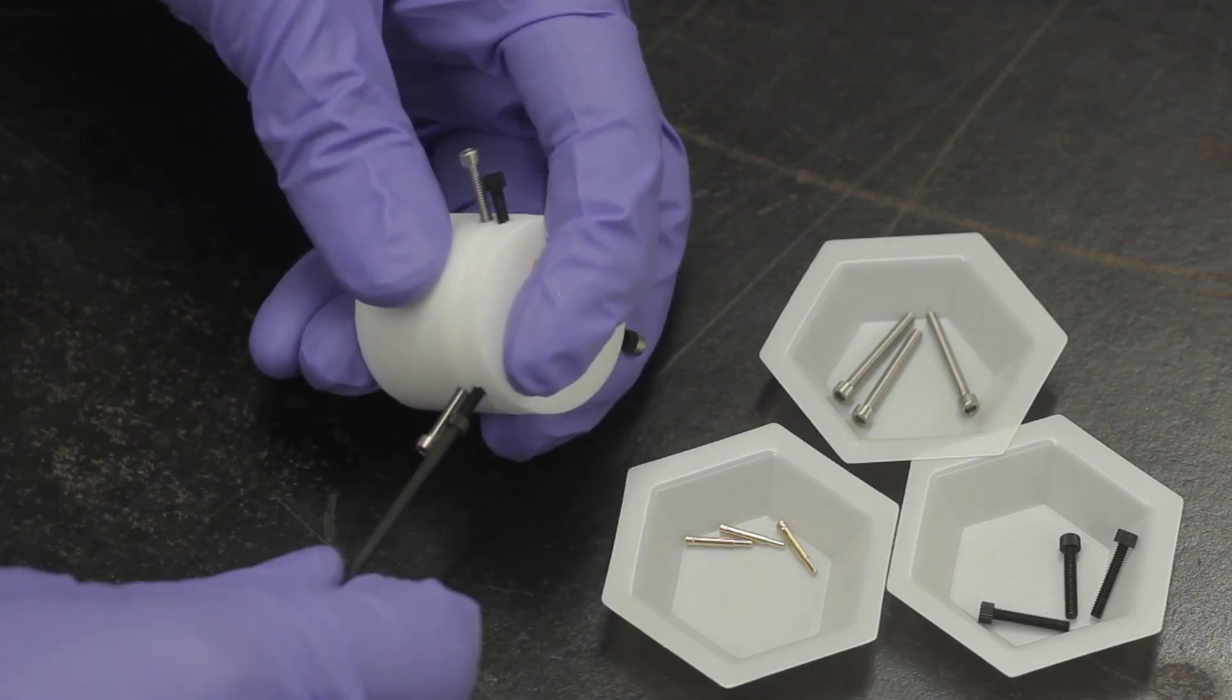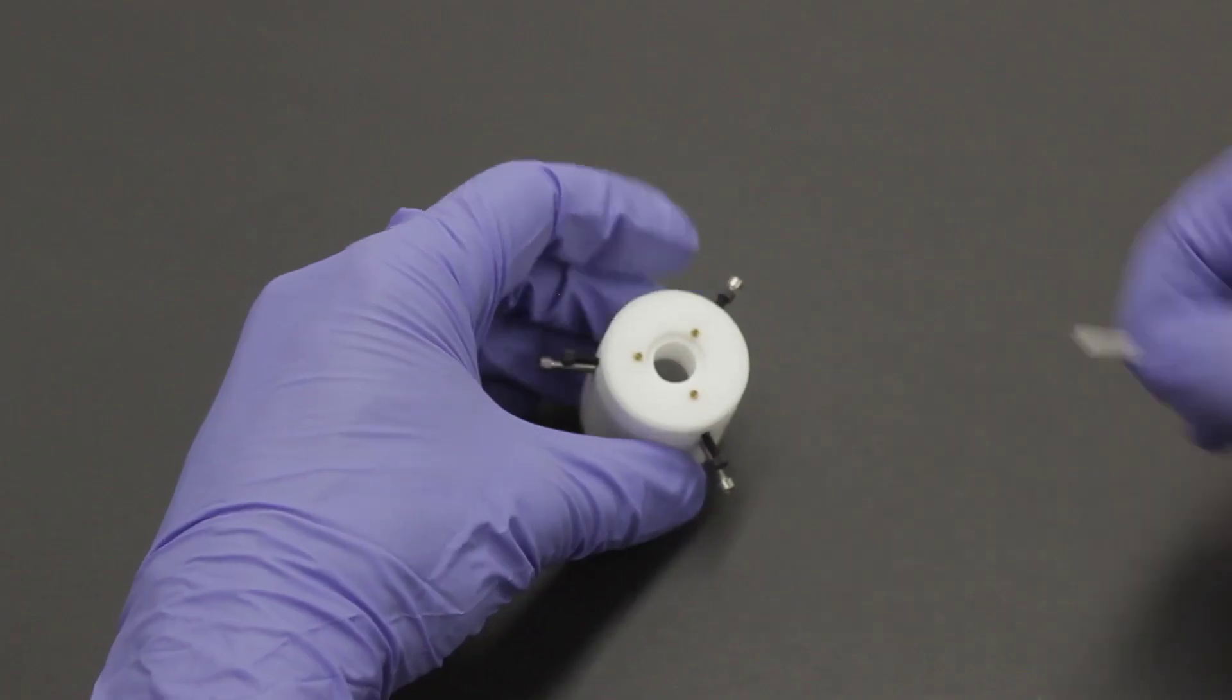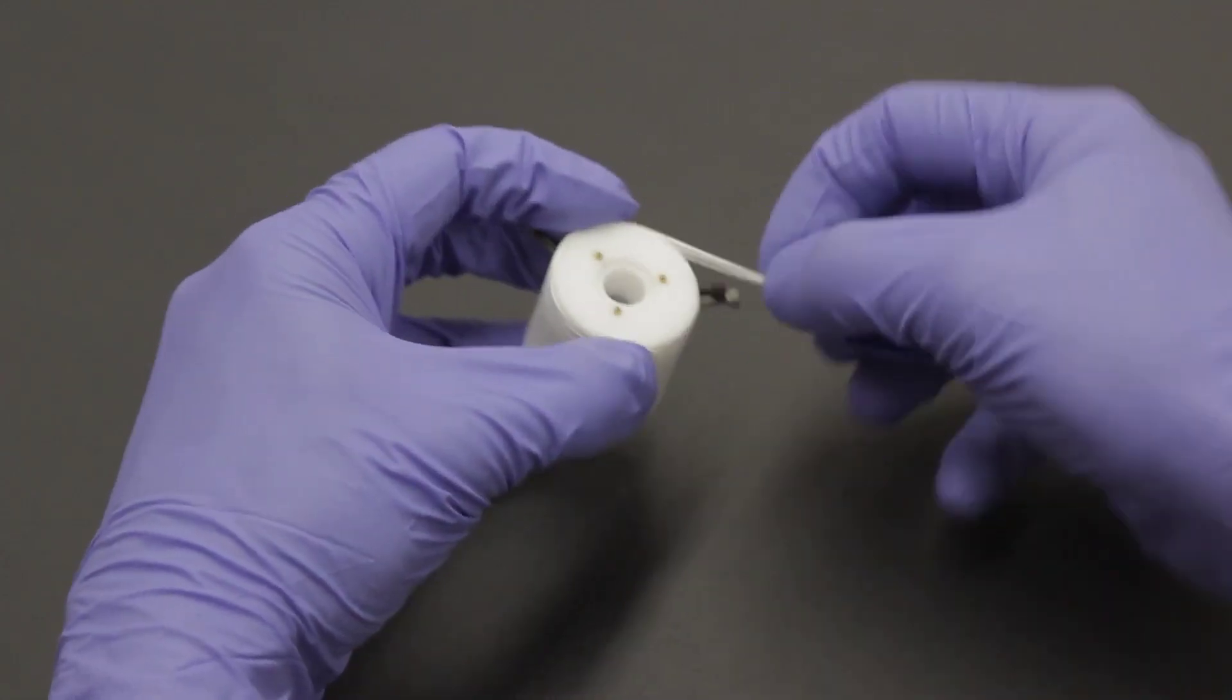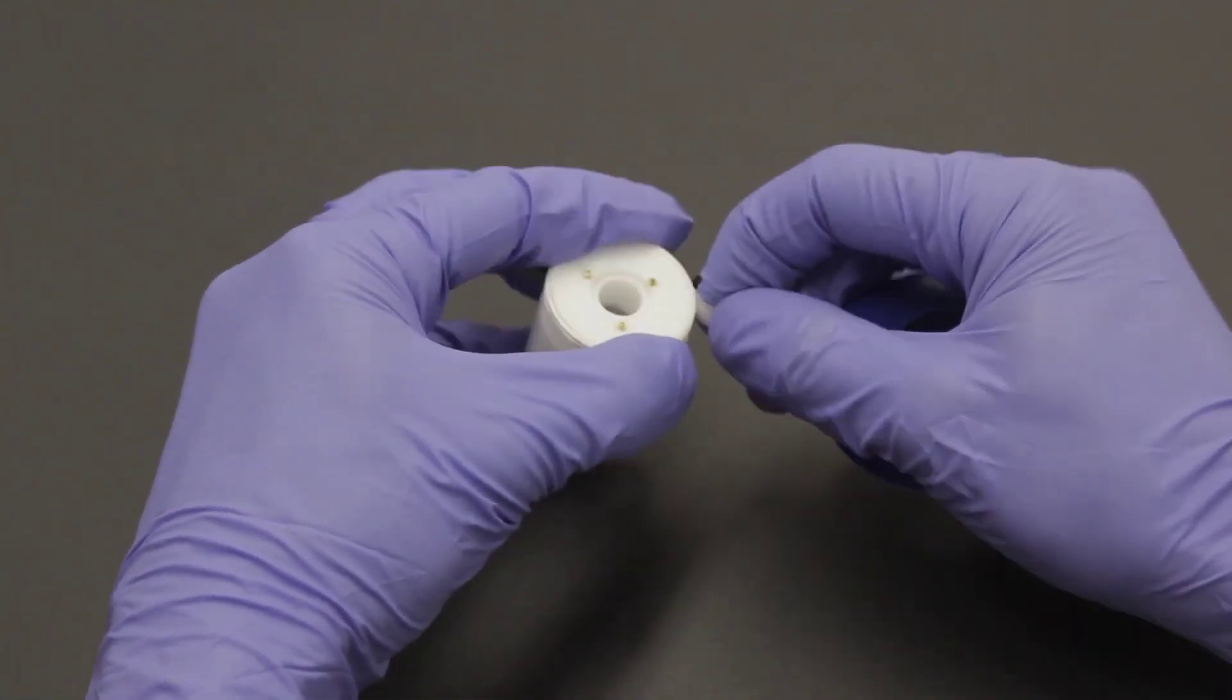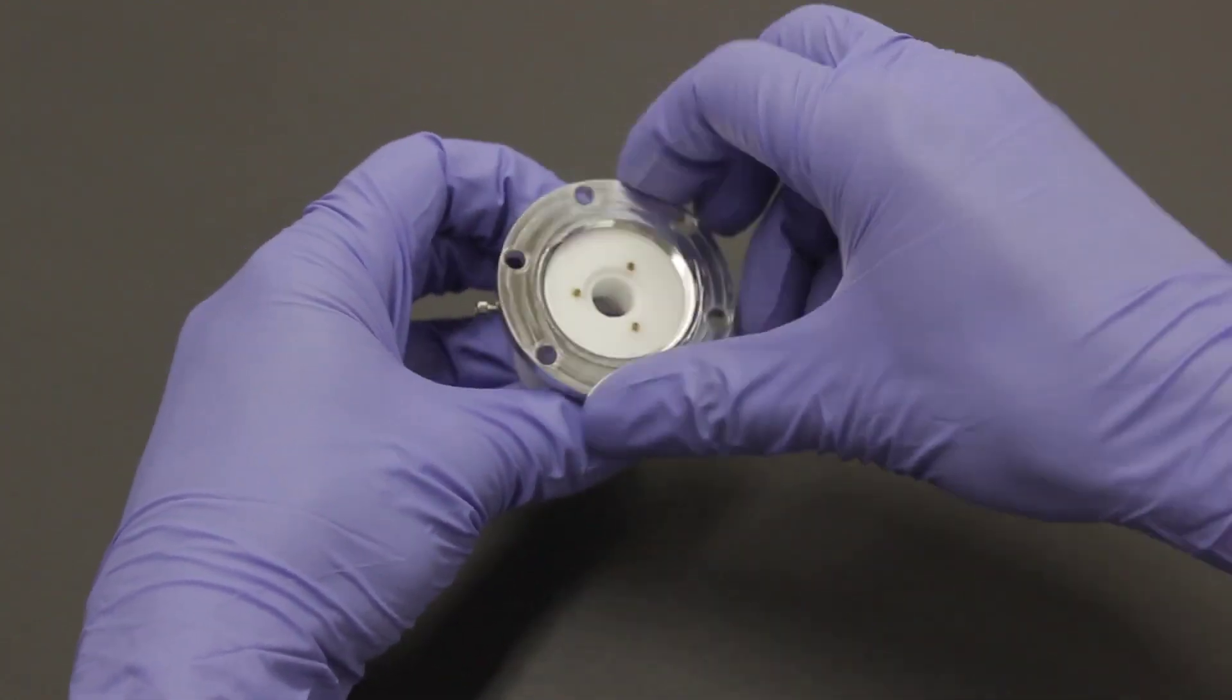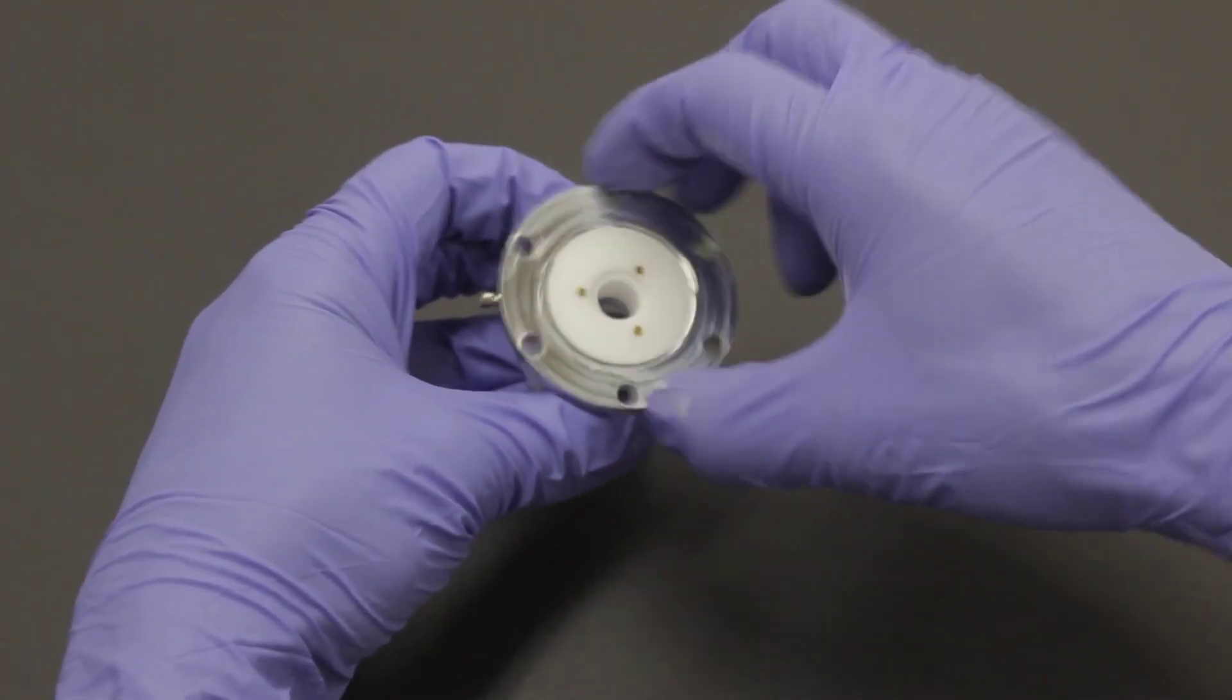The next step is to install the aluminum flange. If you like, you may install PTFE tape on the threads to provide some resistance against loosening. If you choose to use PTFE tape, wrap it around the threads in a clockwise direction as viewed from the bottom of the cell base.